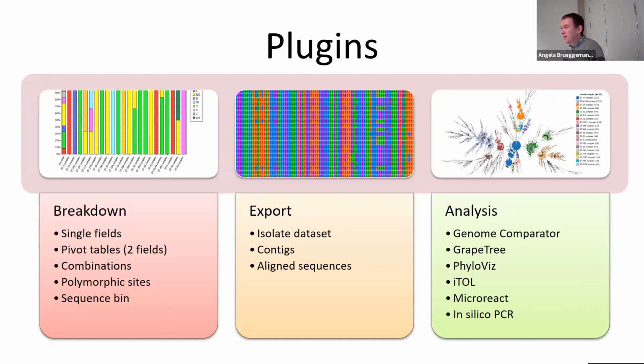Just because of the assumptions that are made in the different methods. And then we have various analyses tools. So we have Genome Comparator, so I'm going to show that. That was really sort of the first genome analysis tool that we had within the system.